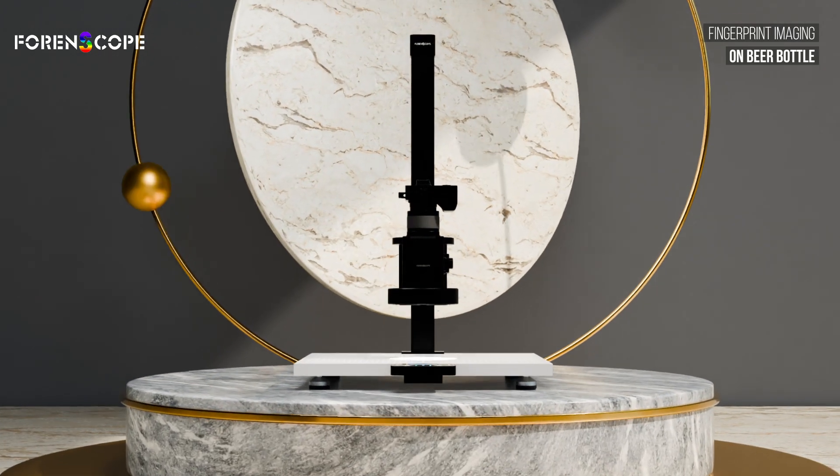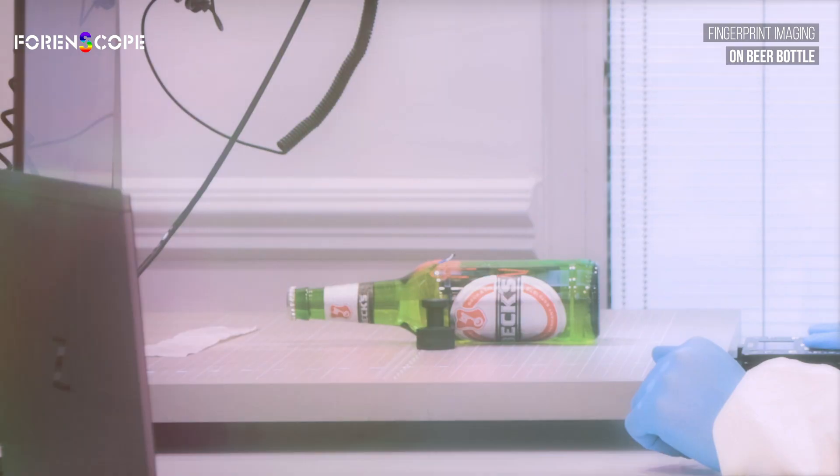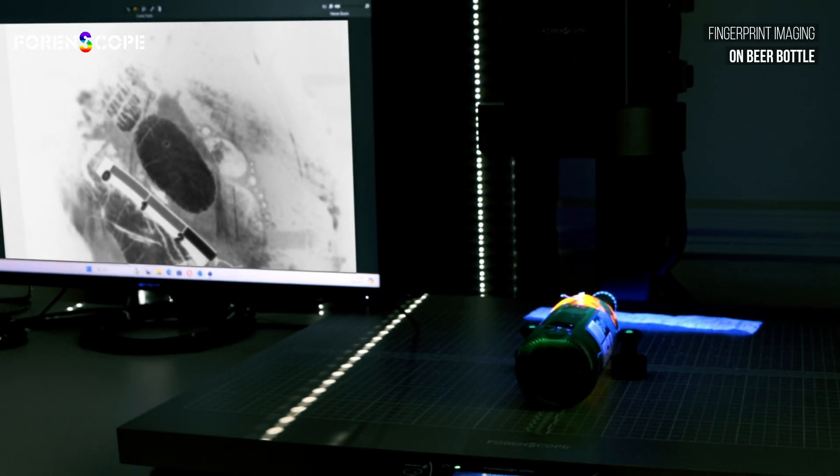Using different lights and filters to reveal powdered fingerprints, even on tricky surfaces like beer bottles. The key is in the combination of lights and filters, meticulously designed to capture every detail. Fingerprint powder enhances the visibility, making the prints pop.